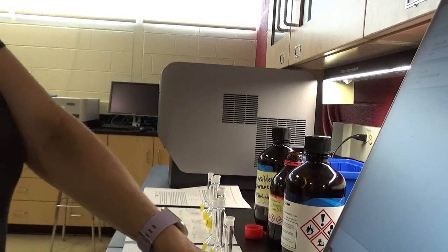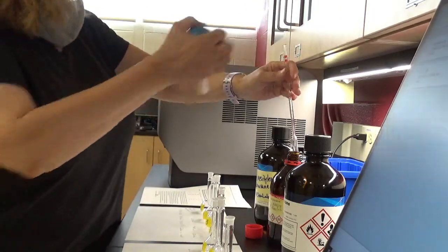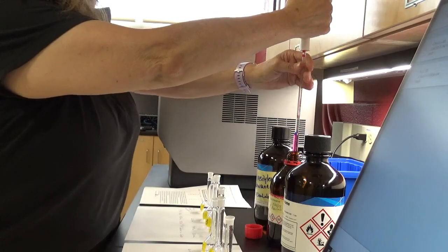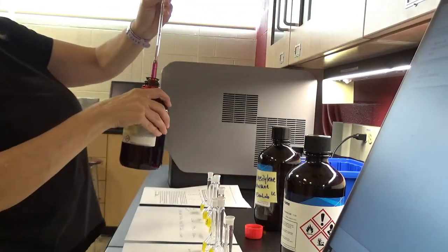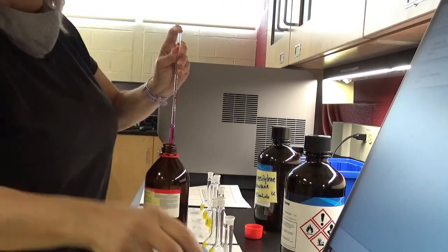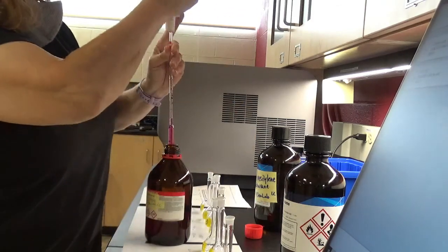All right, I'm going to start pipetting 4 milliliters of this iodine solution into each one of these flasks. You can see the nice purple color of the iodine. Oops, missed the mark from all I'm talking.